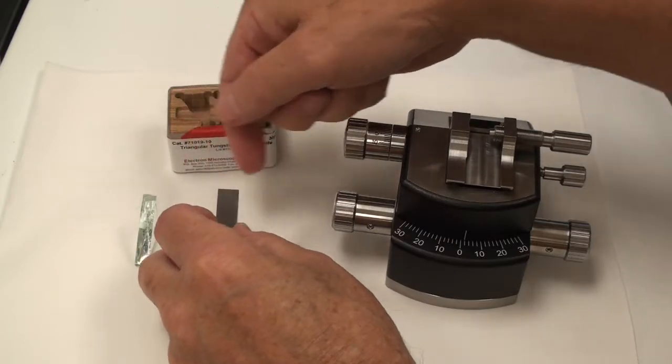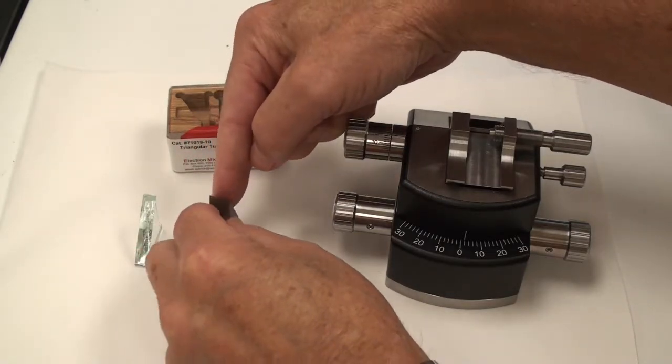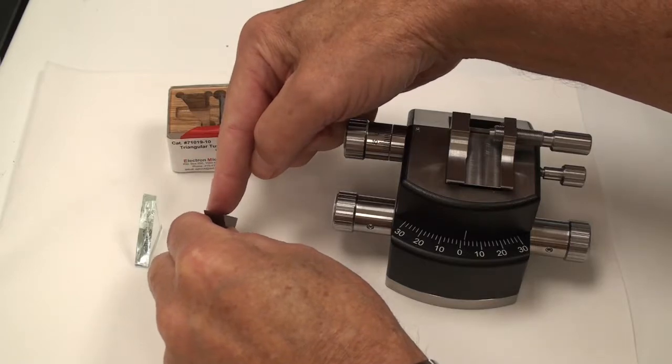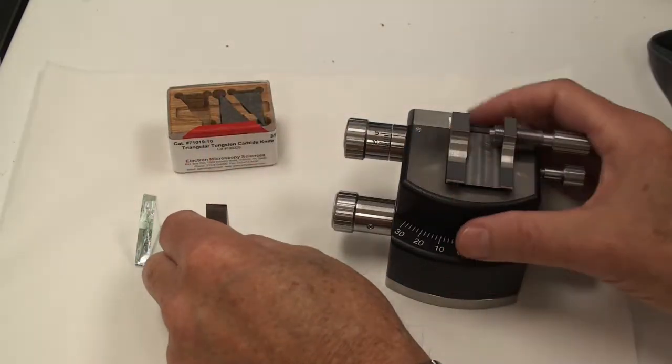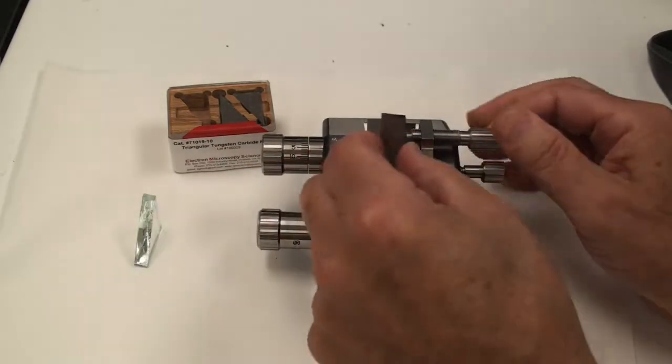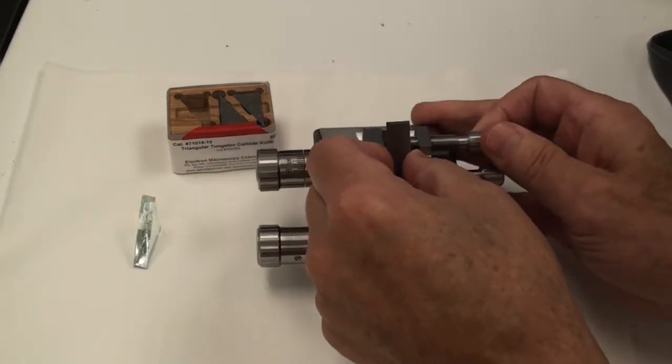One thing nice about this tungsten carbide knife, the DDK, is that it's flat across the back, and that way your block face is planar, so when you cut it with a diamond, it doesn't have edge and curvature to the block face.